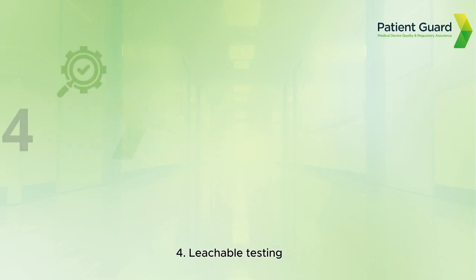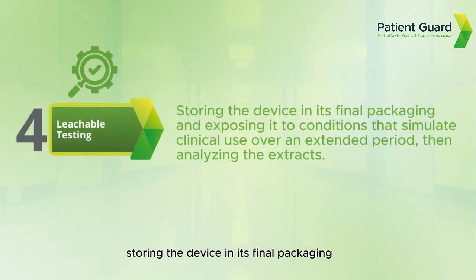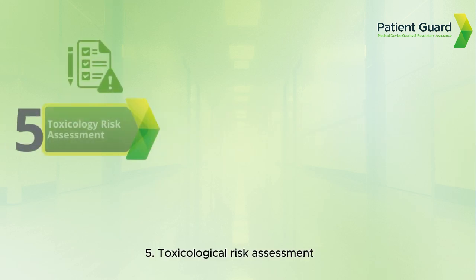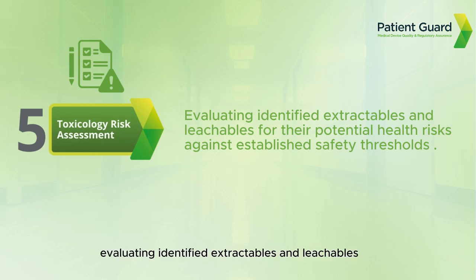4. Leachable testing. Storing the device in its final packaging and exposing it to conditions that simulate clinical use over an extended period, then analyzing the extracts. 5. Toxicological risk assessment. Evaluating identified extractables and leachables for their potential health risks against established safety thresholds.